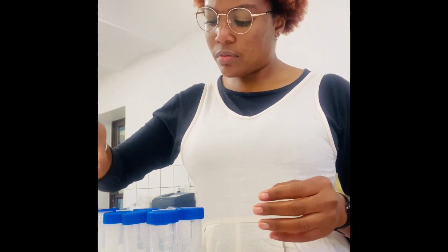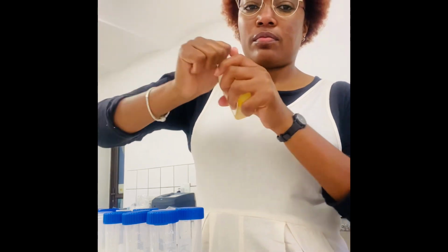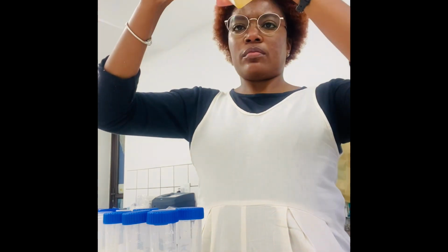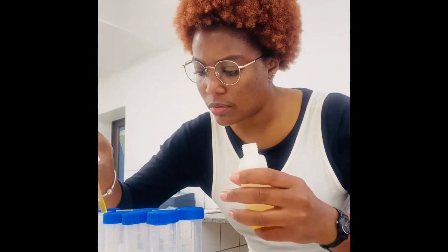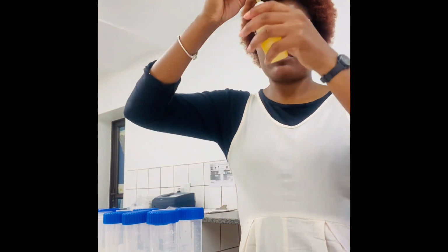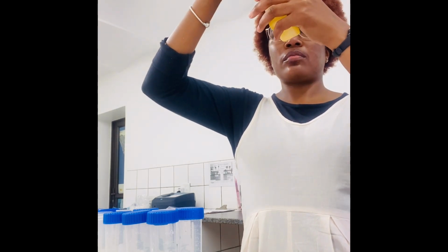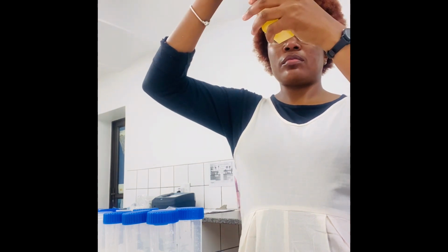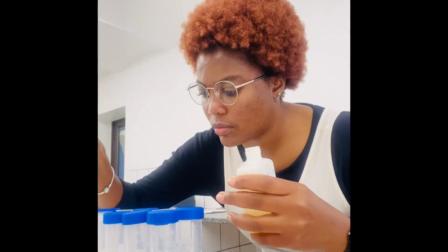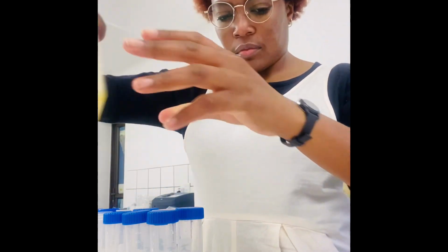If a certain nutrient is in that sample, then the color will change accordingly. For example, with nitrate it changes to pink, with phosphorus it changes to blue, with silica it's just supposed to be clear, and with sulfide it changes to clear with time after it has settled well.